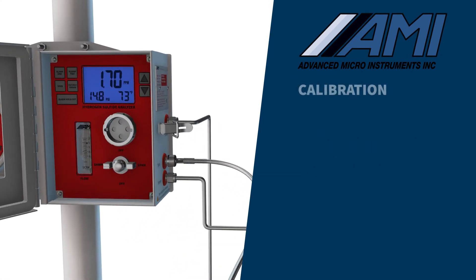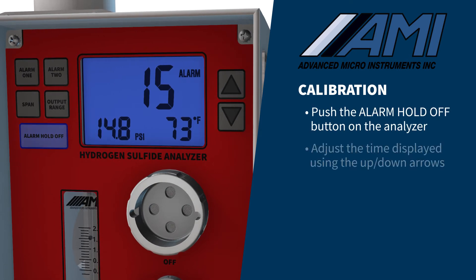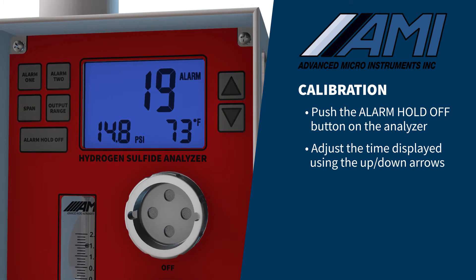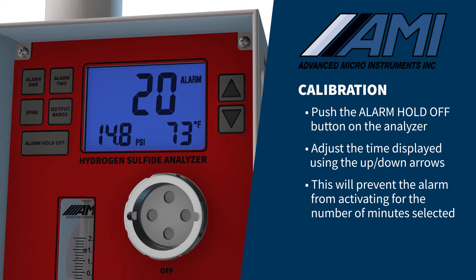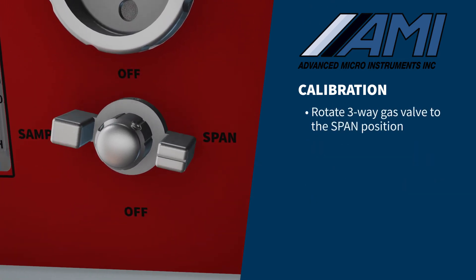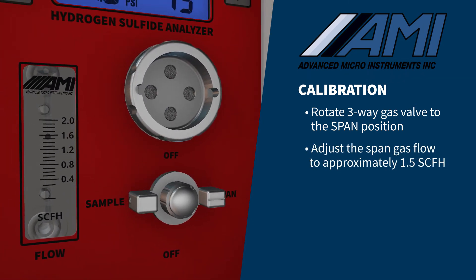We will now demonstrate the calibration process. First, push the alarm hold-off button on the analyzer and adjust the time shown on the LCD in minutes using the up or down arrows. This will bypass the analyzer's relay contacts and analog output to prevent an alarm condition for the number of minutes selected. Then rotate the three-way gas valve to the span position and adjust the span gas flow to approximately 1.5 SCFH.